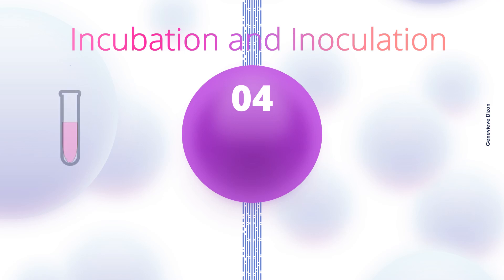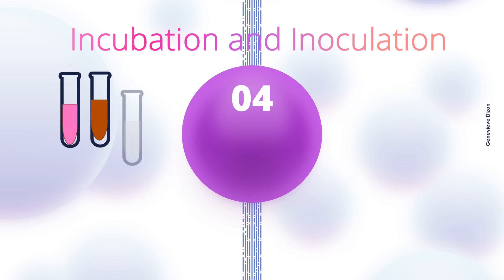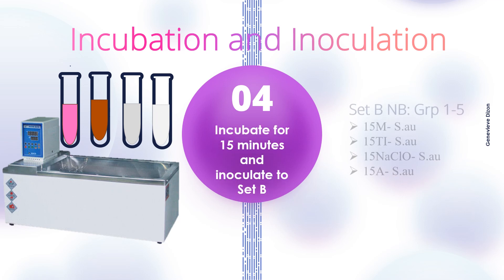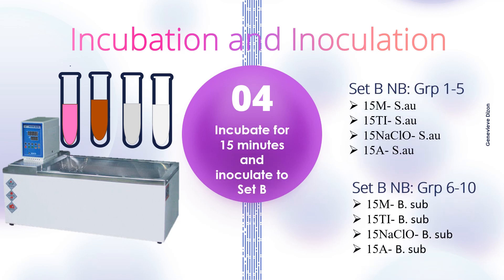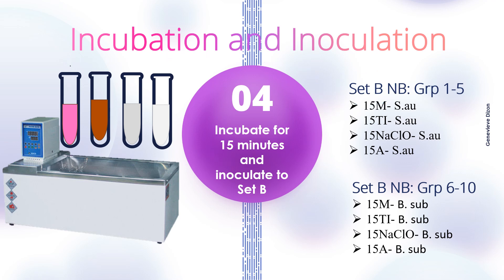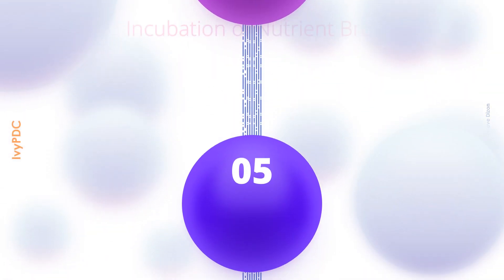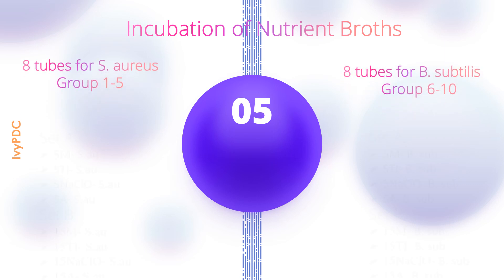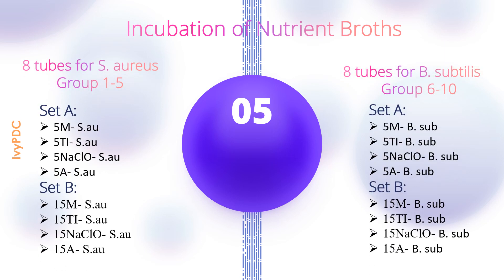The fourth step is the continuation of incubation and inoculation. The chemical tubes remain inside the water bath, and we wait for the second timer to alarm at 15 minutes. When it alarms, transfer a loopful of the chemical into the nutrient broths labeled as Set B. After 15 minutes, each group should have inoculated eight nutrient broths from the different types of chemicals with organisms.